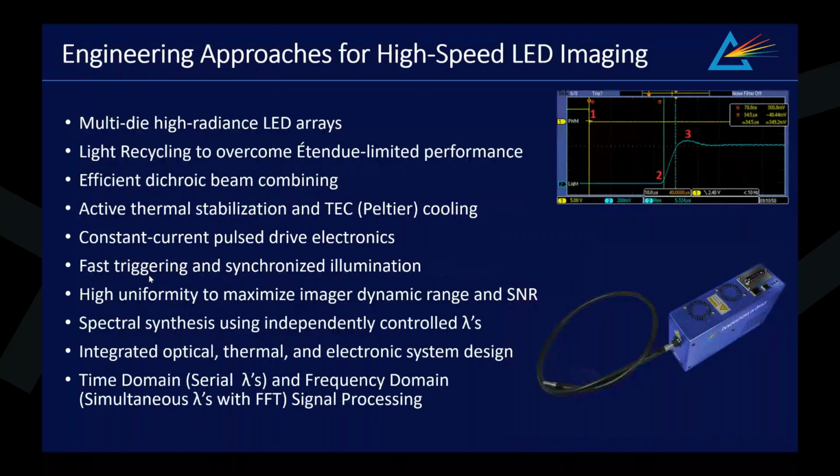With respect to high-speed imaging, peak optical power is only one parameter. Frame rate and repetition rate matter as well. LEDs enable fast repetition, programmable timing, and spectral flexibility. The engineering trade-offs are changing rapidly as LED radiance and pulse drive systems improve.